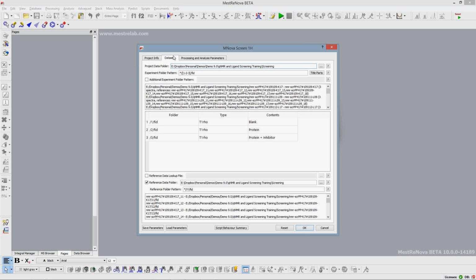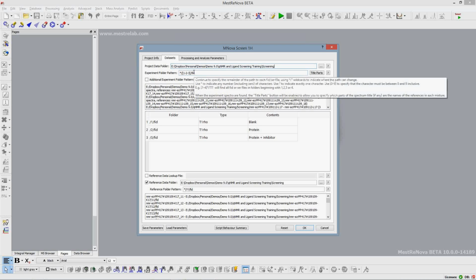Pretty much because since we started the coding of the project, so many different people had saved their data in so many different ways, which is only natural, that we went through many different iterations to make this system as flexible as possible. One point that I would like to make is to get yourself familiarized with the file mask system. You will find definitions of it when you hover over it.